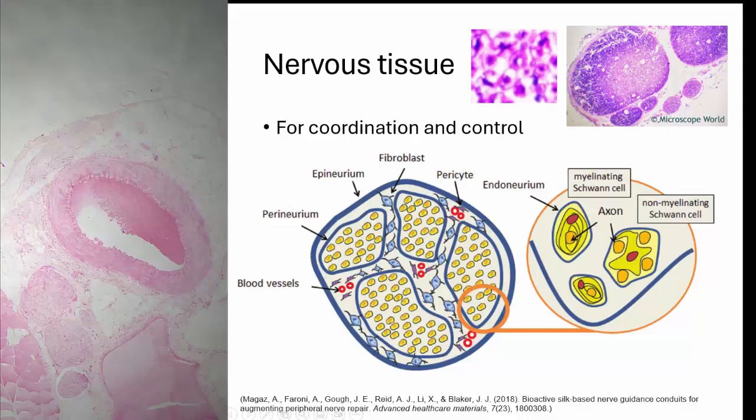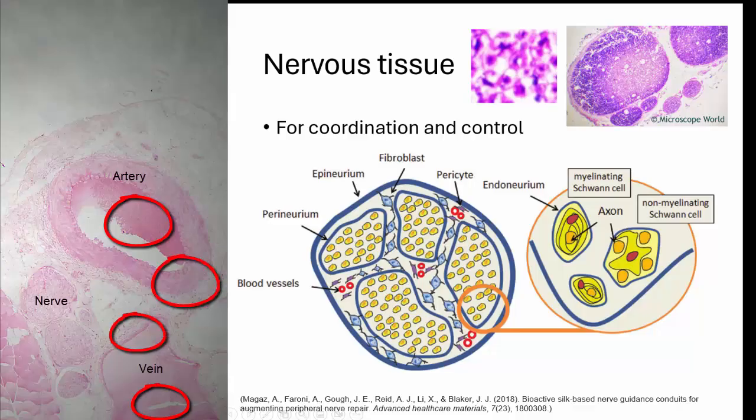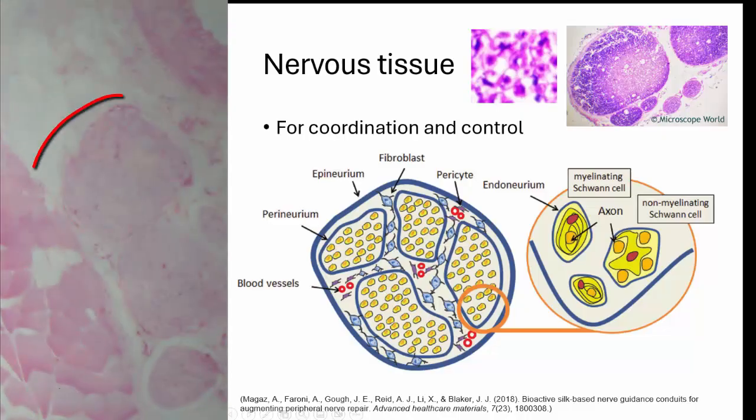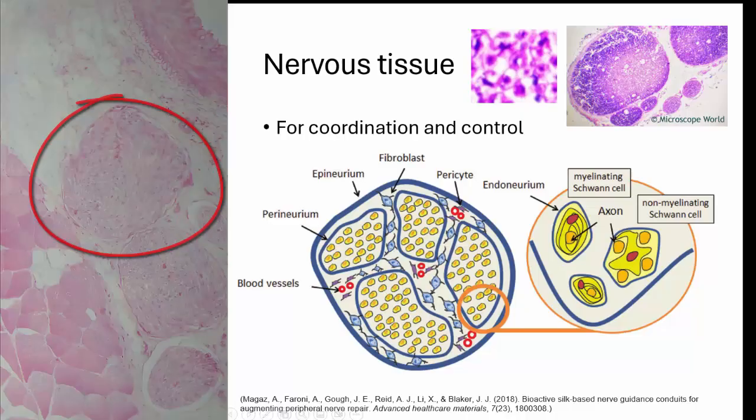So with nervous tissue, I just use a process of elimination. Normally a tube, if it's got nothing in it, it's a lumen. So it's meant to be blank. So things like your stomach are just empty tubes, basically. And if it's not that, and it's full, hopefully it's full of blood, and you can tell by all the different layers whether it's a vein or an artery. And so if it's not any of those and it's just one single thin layer of epithelium around it and it's got an even matrix in between, then I'll go nervous tissue.